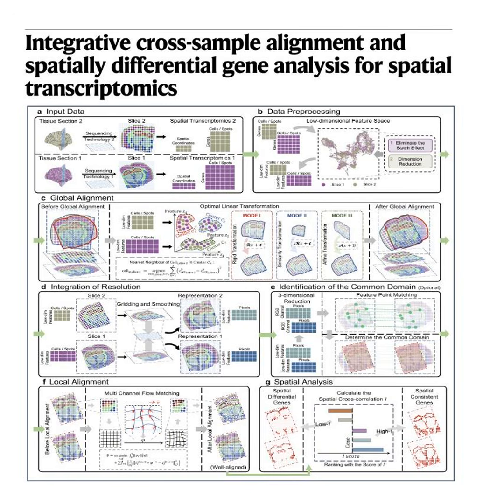That is just stunning. Okay, let's do a quick recap of this final stretch for you. CODA isn't just accurate, it is insanely fast. Super fast. By treating genetic data like a visual image, it processes in seconds instead of hours, using virtually no RAM, meaning it won't crash your computer. It can mix and match data from different platforms, and it can stack 2D slices to build perfect 3D biological models, even of regenerating brains. It really is a powerhouse.